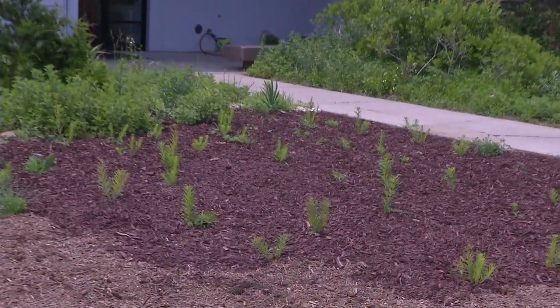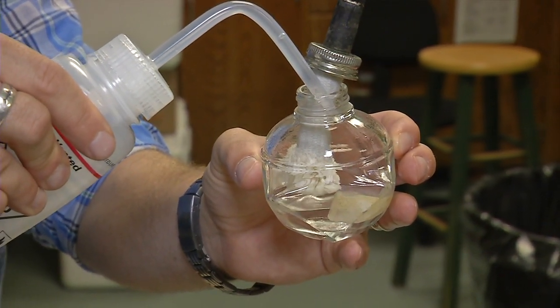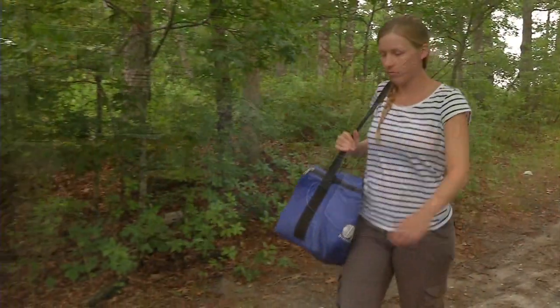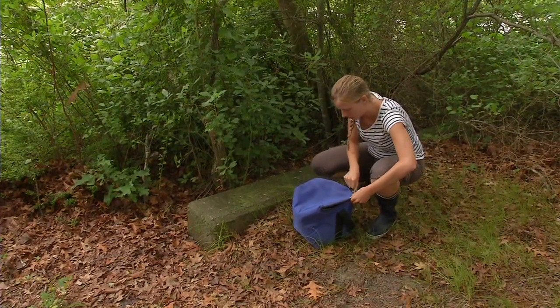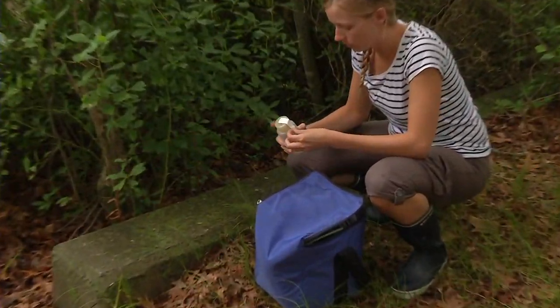The purpose of the lab here is to test the water bodies and to usually educate the different municipalities where the water body lays about what's in their water. And the big one that we do is bacteria enumeration. So we can go in, when there are areas that people are concerned about for either shellfishing or sometimes even bathing, and get a water sample and see how much bacteria is in the water. That gives municipalities a general idea of what's going on. And a lot of times that's all usually dictated by the New York State DEC anyway for shellfishing.